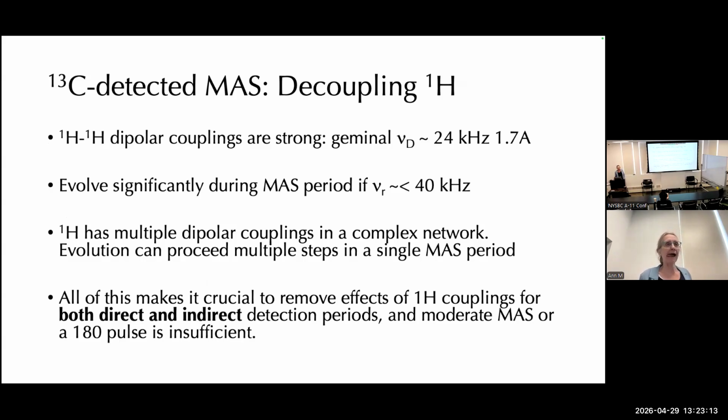Now, here's why it's not all review. So we've talked about a few things that we saw before, and I'm just refreshing your memory and carefully defining what I mean by decoupling, but we have another case that's got some ugly features that we never did talk about before. Let's say you're doing carbon detect, you're doing an MAS experiment on your nucleic acids, and you have some proton-proton couplings and some carbon-proton couplings, and both of them are quite strong.